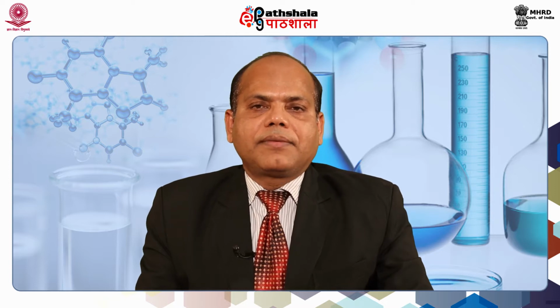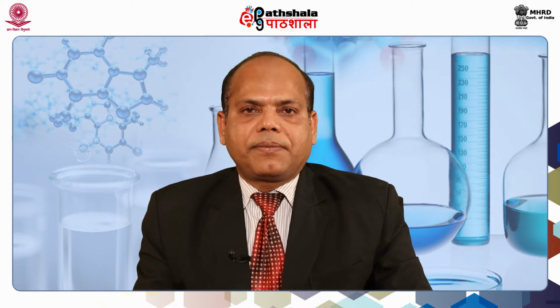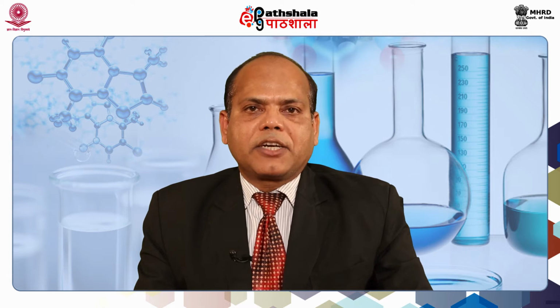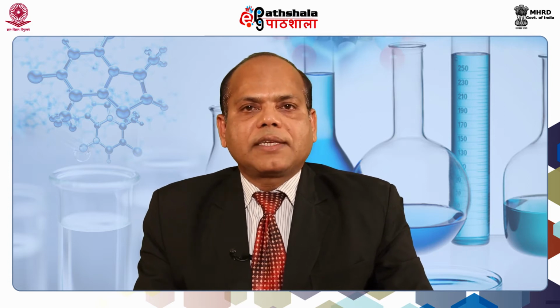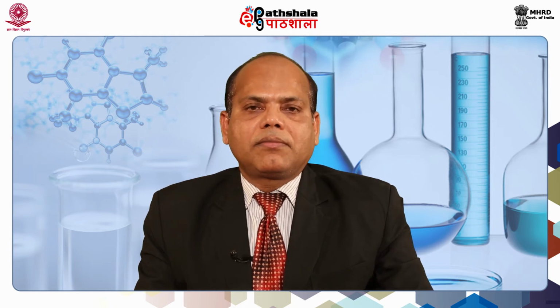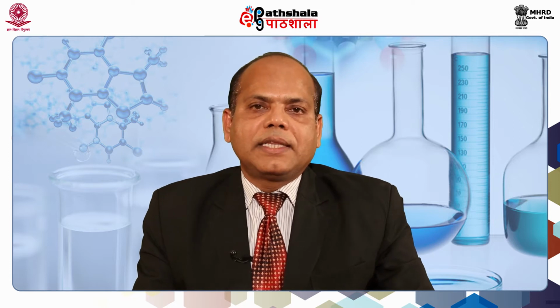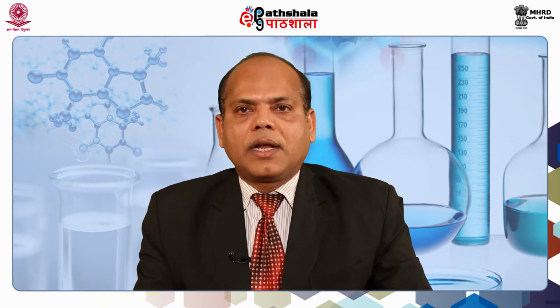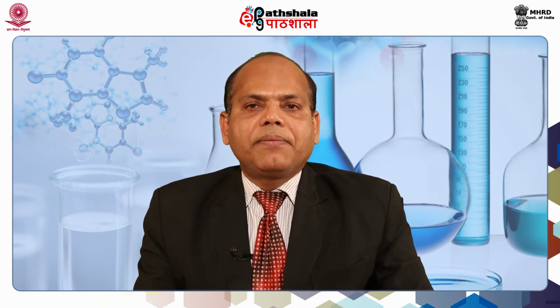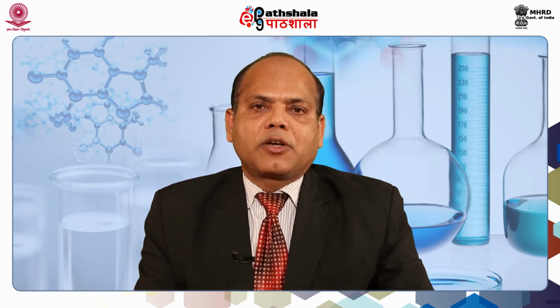In the lab itself, when we are doing biology, we are following different aspects of it. One of the most potential areas of late has been mass spectrometry. By using mass spectrometry, we can determine the exact mass of a molecule. When we are talking of a molecule, this may be proteins, this may be small molecules in the natural substances, and subsequently we can identify those small molecules with the help of mass spectrometry.